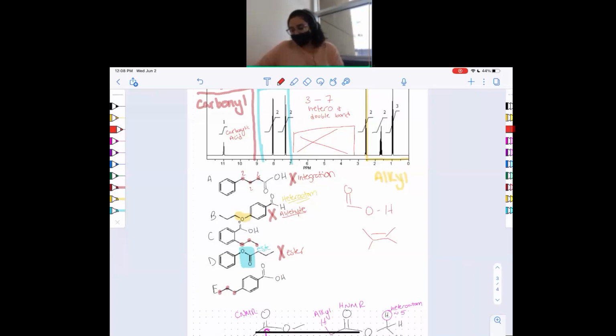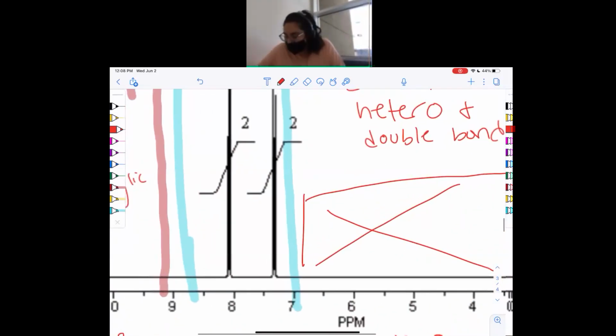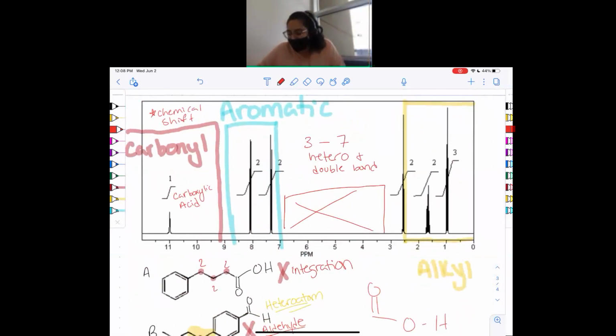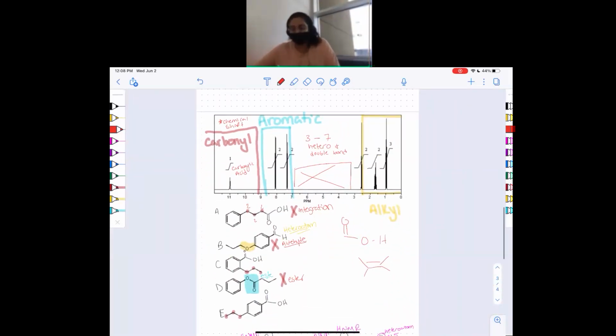And the next thing I would personally look at is, if you go in, it's really hard to see the splitting, right? So basically what I would do is pay attention to the aromatic ring. So this is where I tend to lose people. You guys have been pretty good so far, so I hope I don't confuse you.